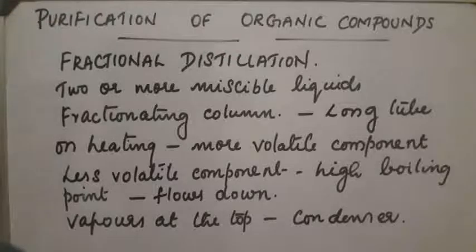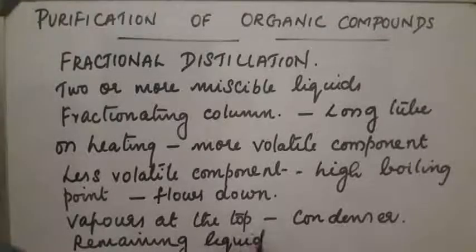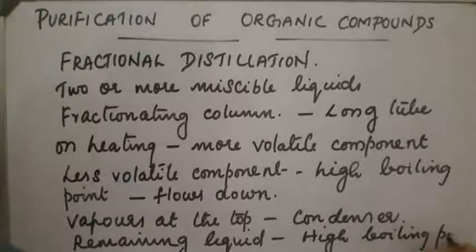As a result of this vaporization and condensation, we separate different components in the mixture which have almost similar boiling points, and the remaining liquid in the flask is enriched with those compounds having high boiling point. Like this we can separate the components.